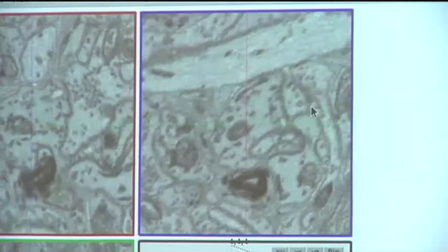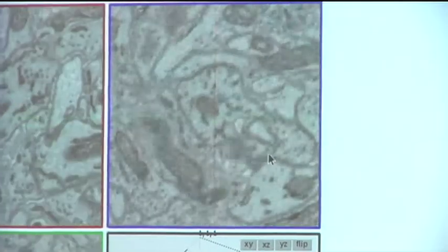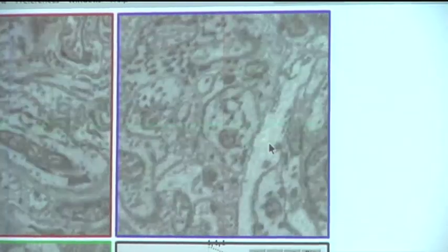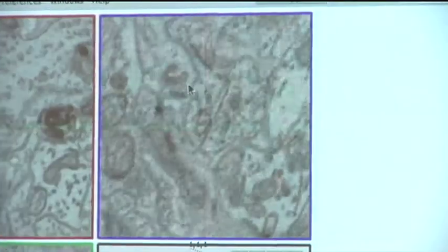Yeah, stick with it. And movement helps, as you can see, right? When it's still, it's much more difficult to understand, but if it's moving, it helps a lot. So our brains are very good at integrating information over moving or changing but correlated images. So that is also something that you can see here clearly. Still in it, very good.